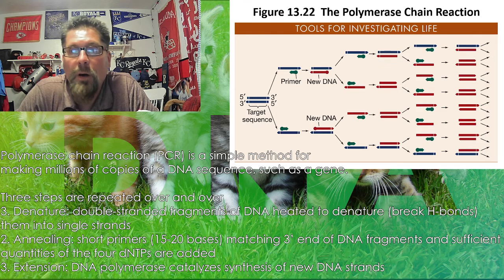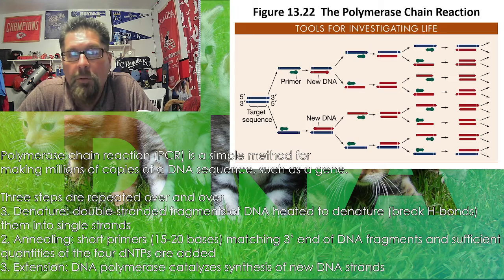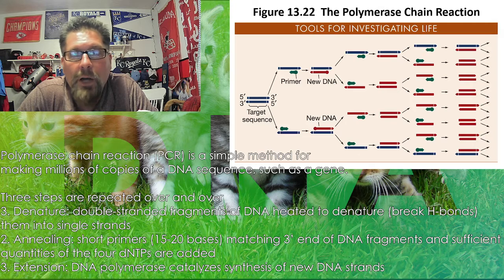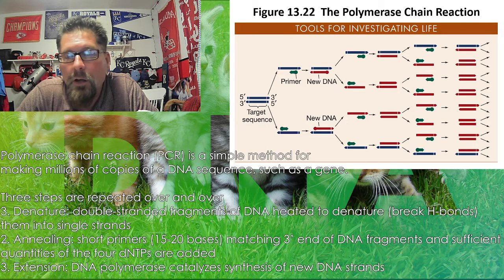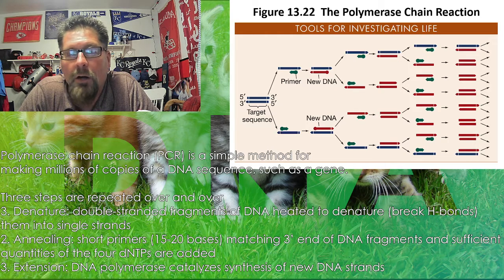Now when we're talking polymerase chain reaction, what we're talking about here is the idea of building or replicating DNA with the idea of studying it to understand the process of what the DNA codes for, what proteins are made, and understanding those aspects. And this has come out of the Sanger method that we talked about back in the second video, experiments 2.